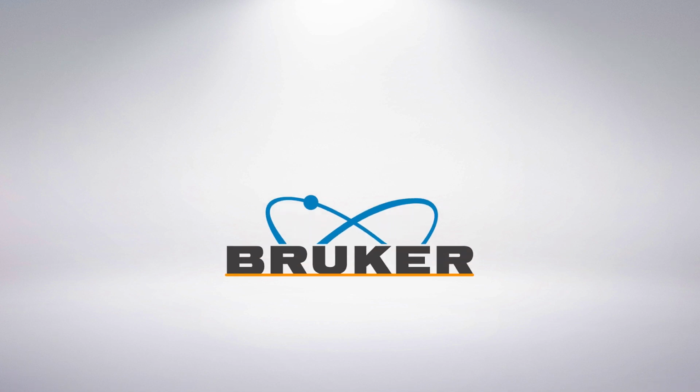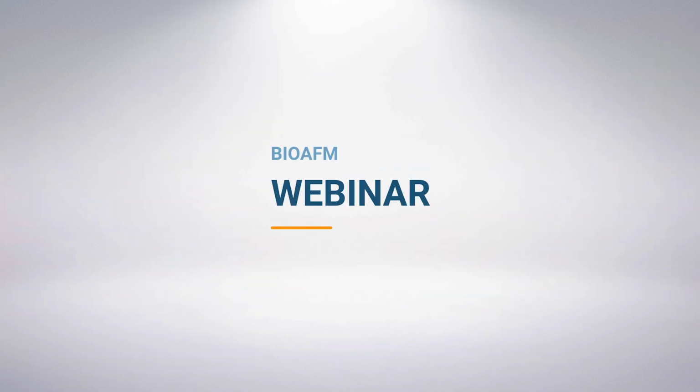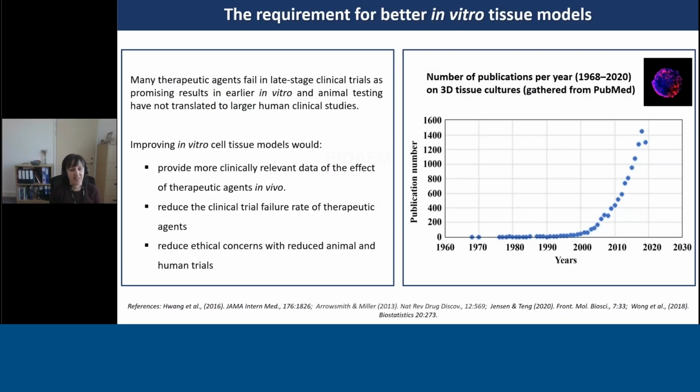Today we're going to talk about biomechanical analysis of 3D in vitro tissue models using AFM. So many therapeutic agents fail in late-stage clinical trials, as promising results in earlier in vitro and animal testing have not translated to larger human clinical studies. There's a study that says that 54% of drugs fail in clinical trials at stage 3.